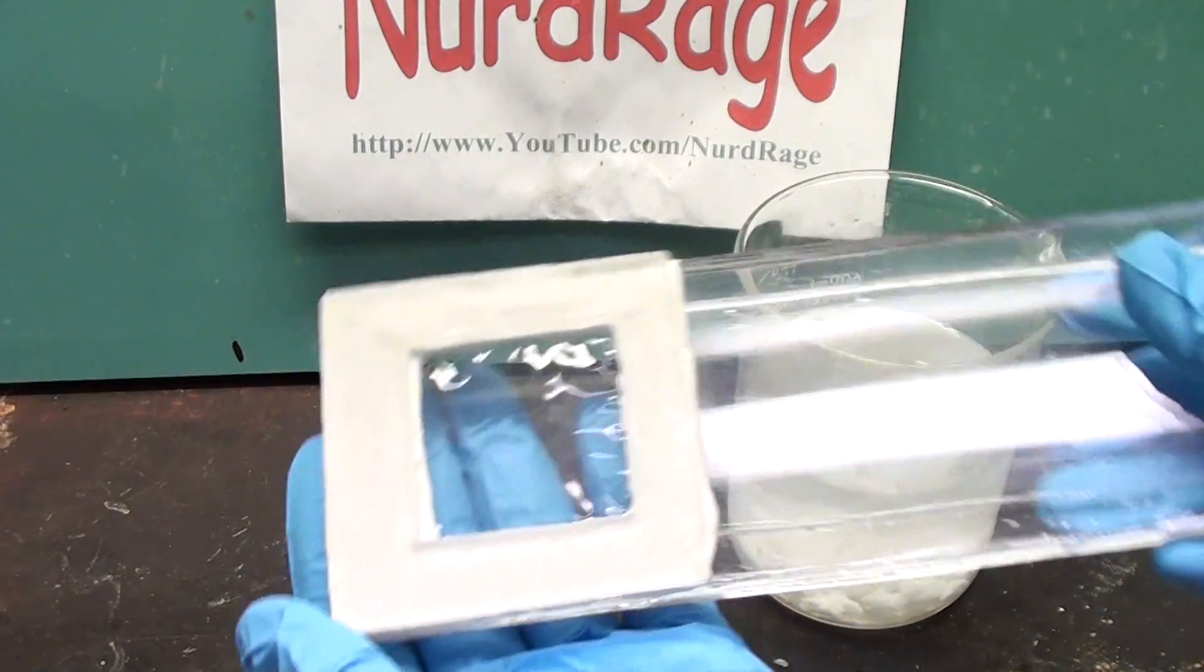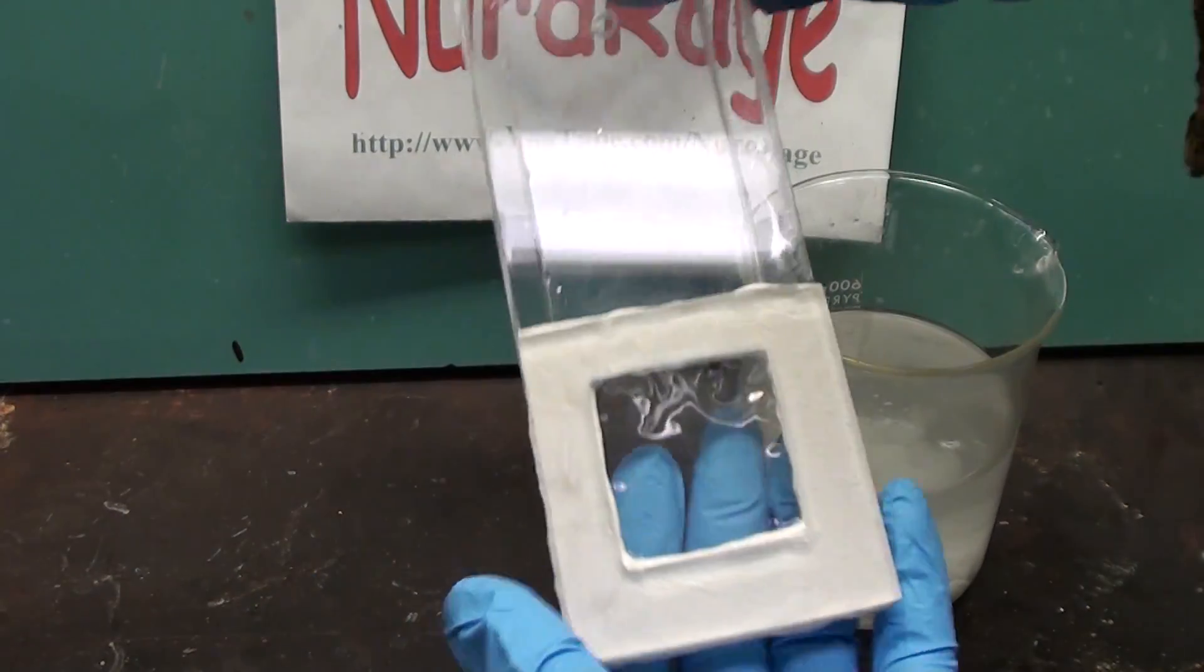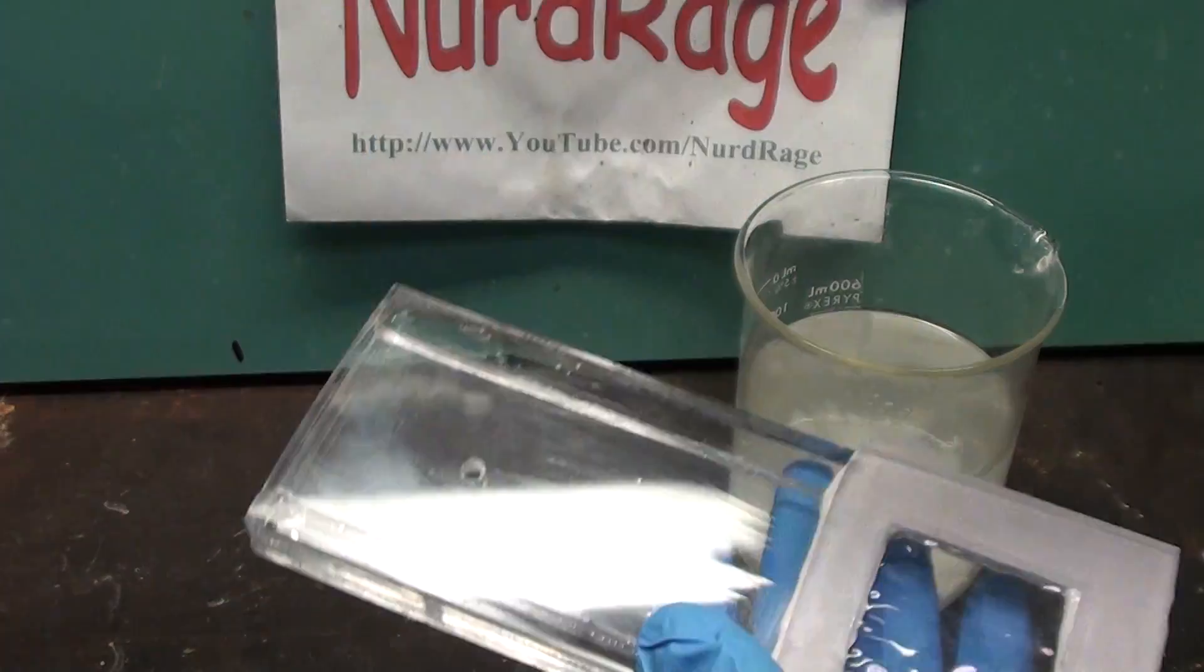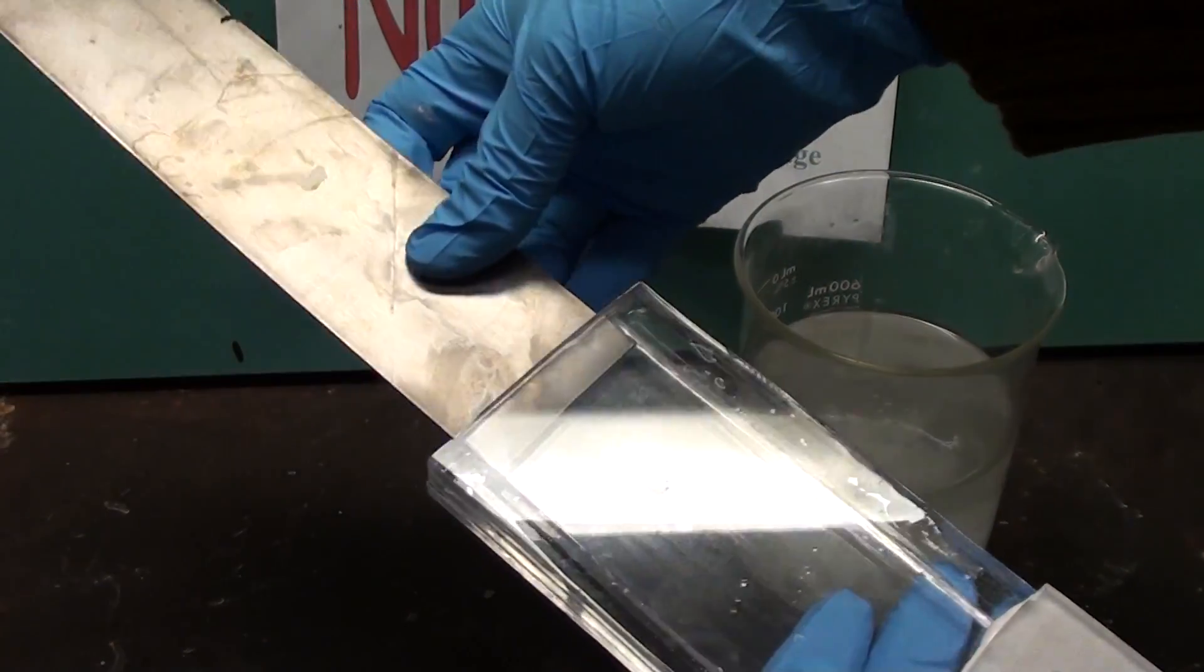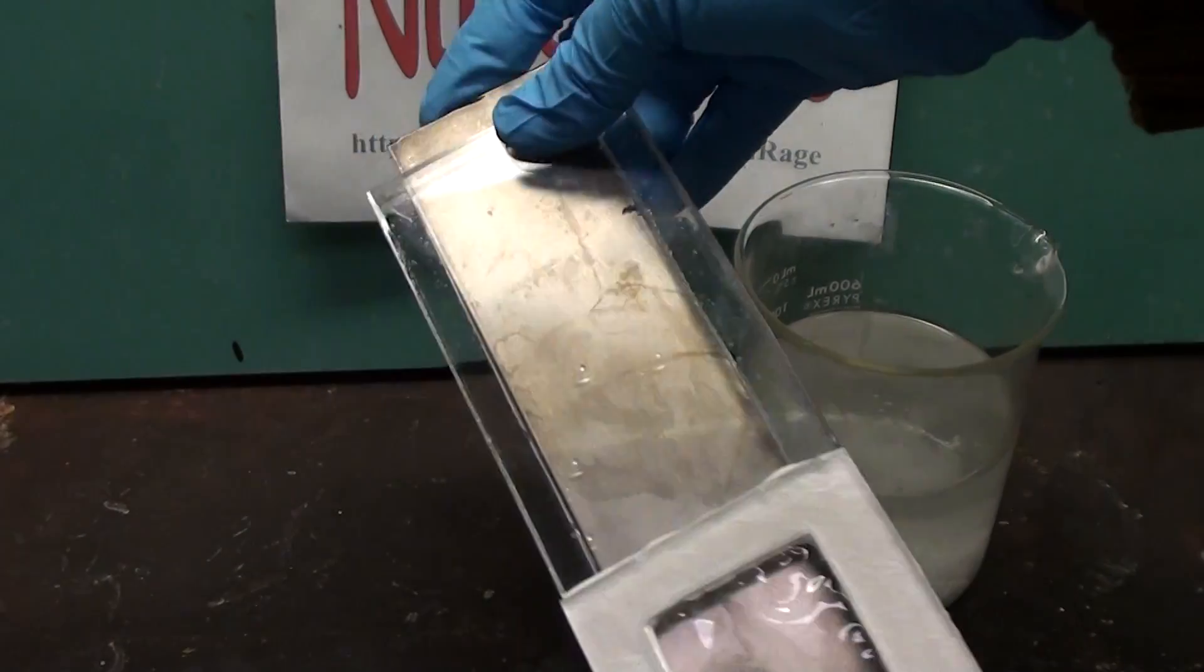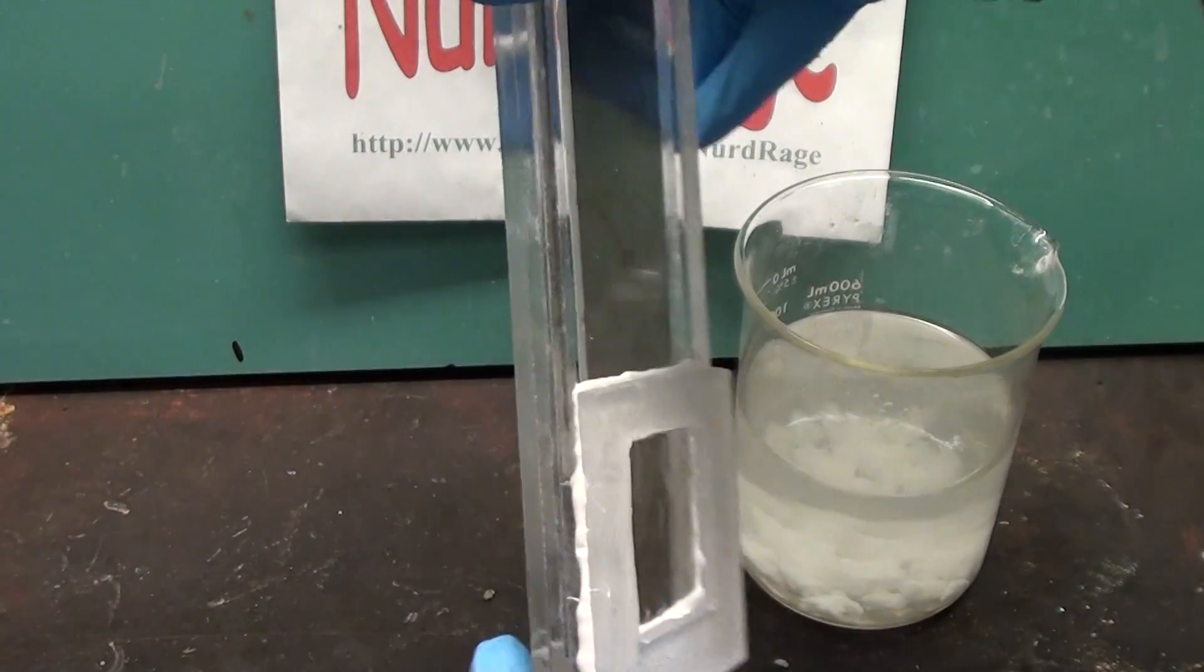Then we get our nafion divided membrane cell that we built in the previous video. This will serve as the cathode compartment. I'm going to use a titanium plate as the cathode but you can use copper or steel since the cathode isn't subject to the same oxidative stresses as the anode.